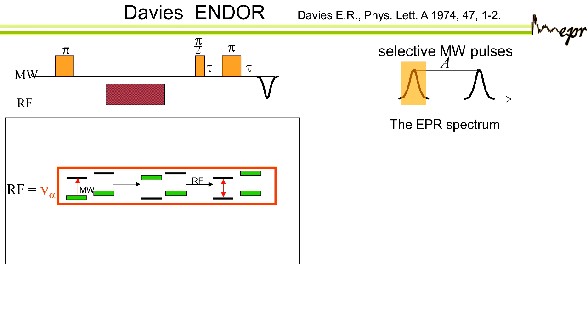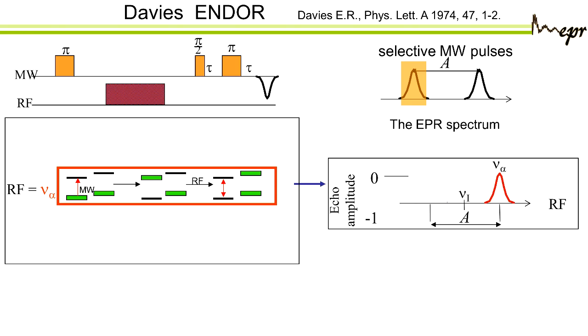Now I come with the RF pulse, and I'm hitting the upper NMR transition. If you look in the middle, the upper one, I transfer the population, I transfer the green to the other manifold. So now what happens to the line that I observe? There's no population difference, it disappeared, right? Okay, so now you see the line that I was inverting, I have no signal.